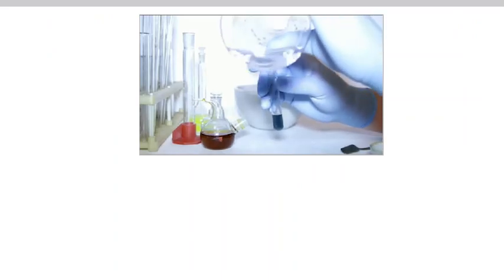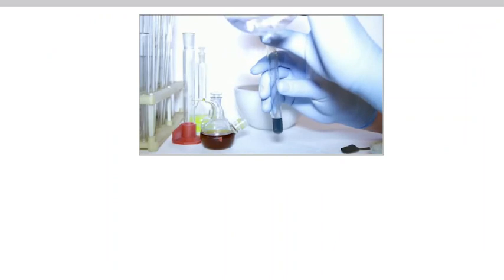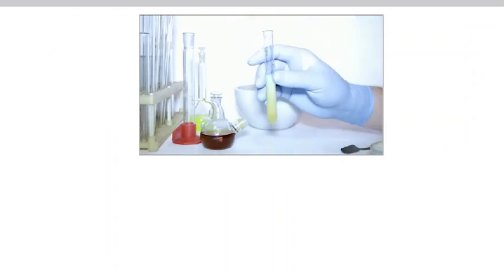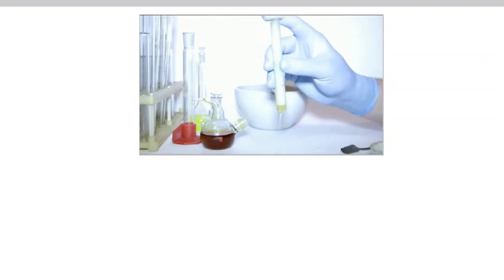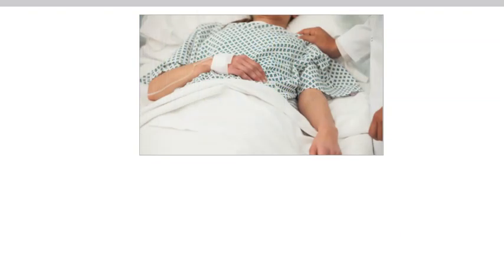A professor of chemistry with an international reputation as a research chemist was preparing an experiment that involved the use of dimethylmercury. The professor spilled a few drops of the compound on her gloved hand, but thought the latex gloves would be protective. They proved to be inadequate, and the toxin passed through the glove and was absorbed into her system. 6 months later, she slipped into a coma and died from acute mercury poisoning.